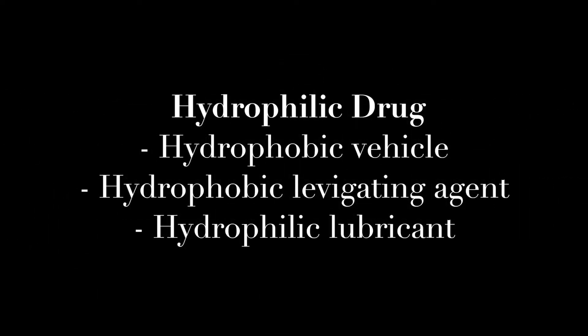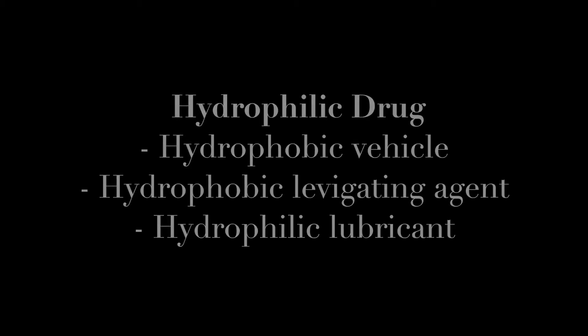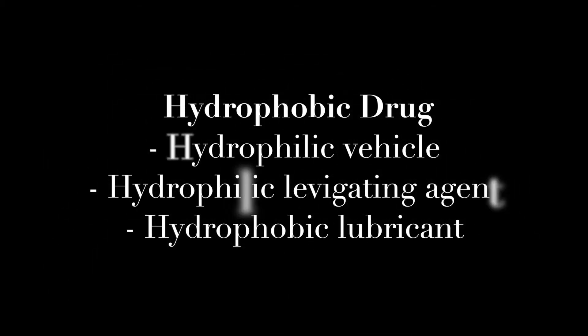For step six, you are going to lubricate the suppository mold. It's very important to remember that the lubricant you use is dependent on the drug that you are using in the prescription. If the drug is hydrophilic, then the vehicle you use to suspend the drug must be hydrophobic. The reason for this is so the drug will be released from the vehicle when inserted into the person's body. Since the vehicle is hydrophobic, the lubricant must be hydrophilic.